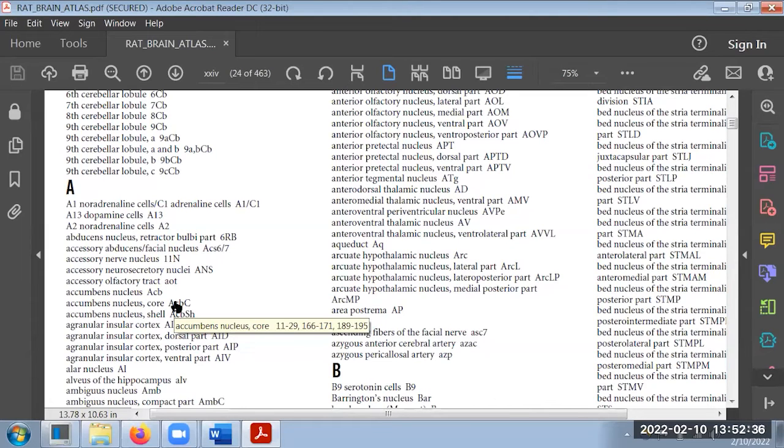We're not going to worry about sagittal stuff. We're not going to worry about horizontal stuff. We're just going to stick with coronal. It's definitely easier to work with. And that's also because the sections we're using are coronal sections. So we're not going to try to do any sort of weird figuring out otherwise.